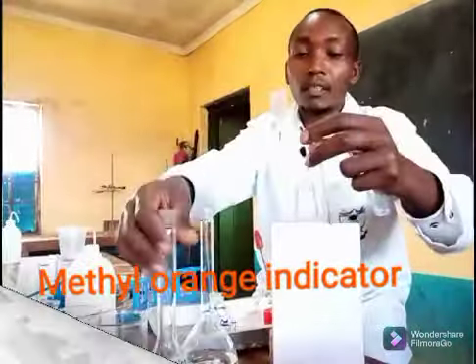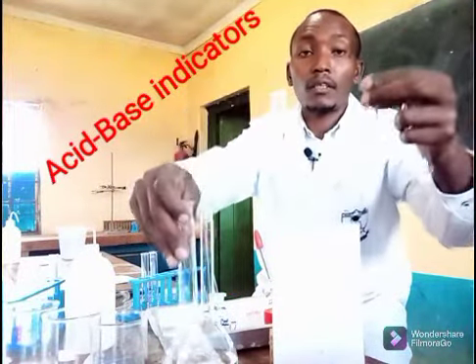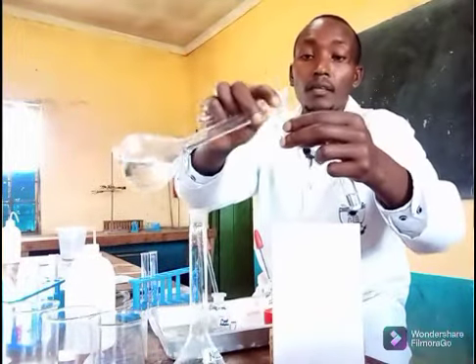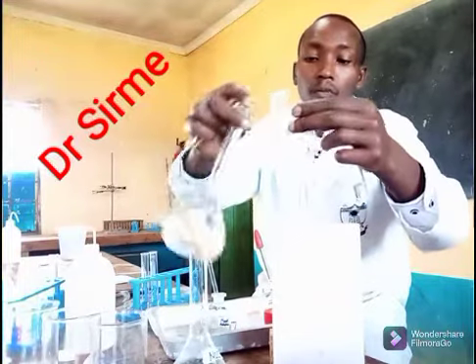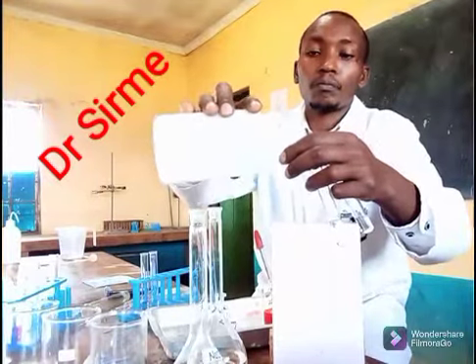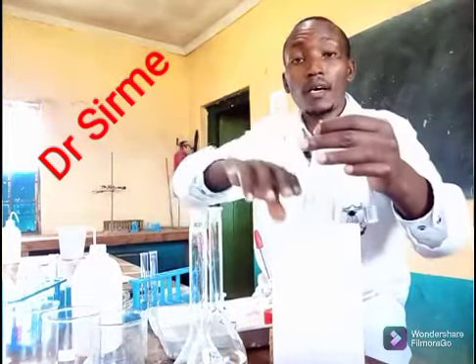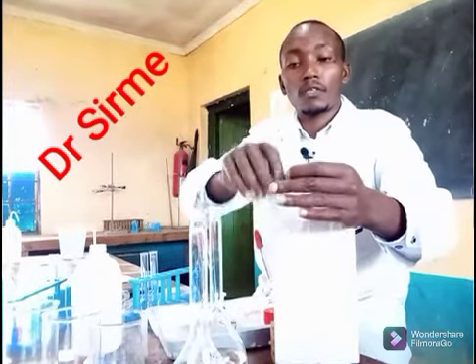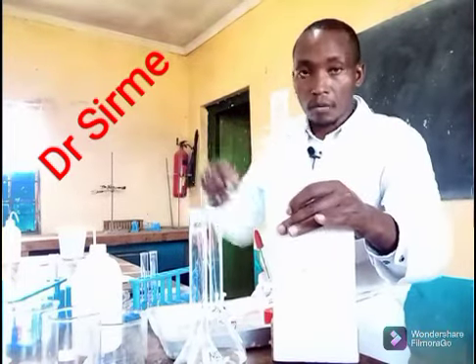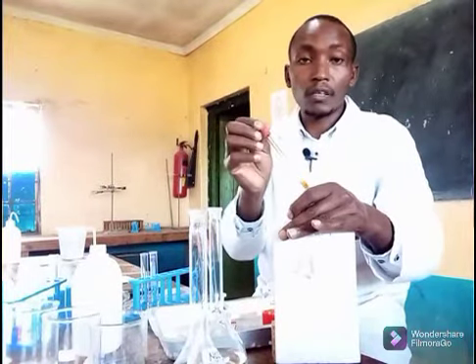So I'll have a sample of the substances I'm working with. The first one is sodium hydroxide. The next I'll place an acid, just a little, and finally I'll have some distilled water. So the indicator I'm going to use is the methyl orange. In that order, I hope my plate there will help you contrast the colors.